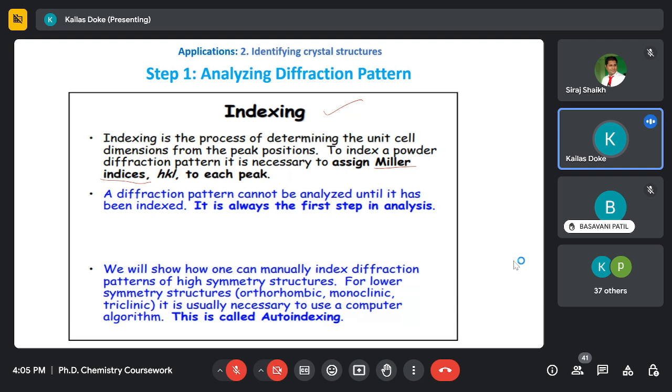That is a modification. With the help of this equation, we can find out the distance between two HKL planes in the crystal system from the diffraction peaks. So how we analyze a cubical pattern, I'm going to explain in the next slide.